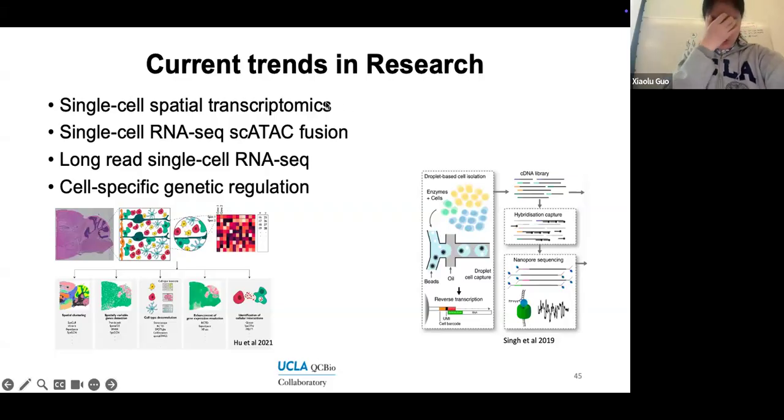And what they currently do is use single cell data to match the spatial transcriptomics, using single cell label transfer to infer some information about the spatial. Is that how they, so this Allen Brain Atlas, I'm not sure if you have seen it, they have pieces of brain tissue. Did they take the single cell and infer it onto the spatial?